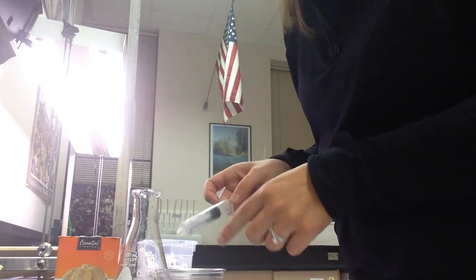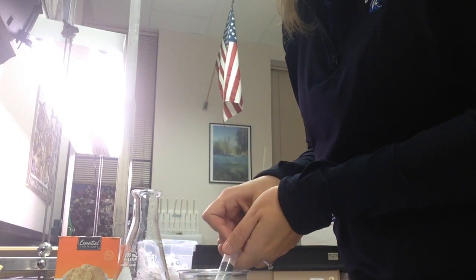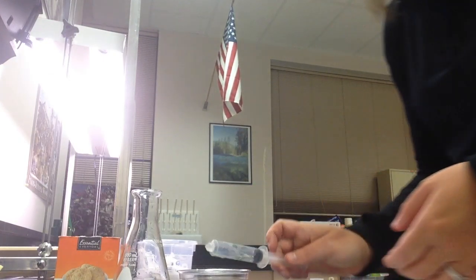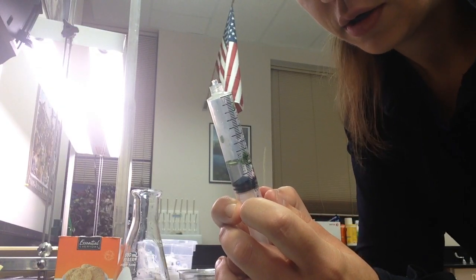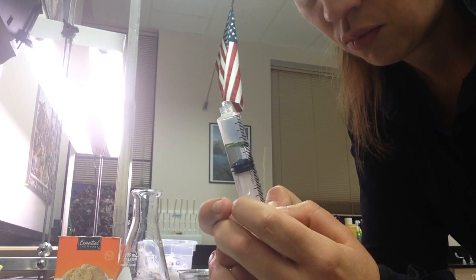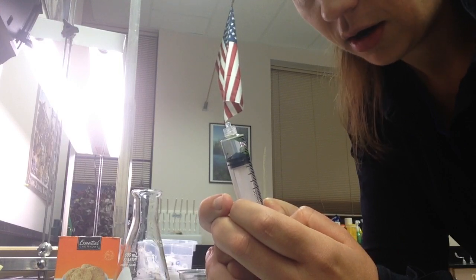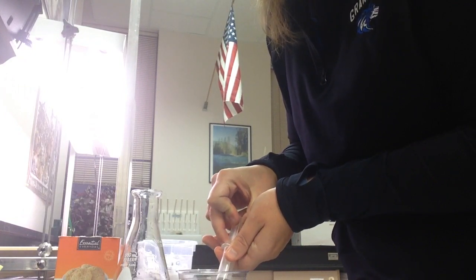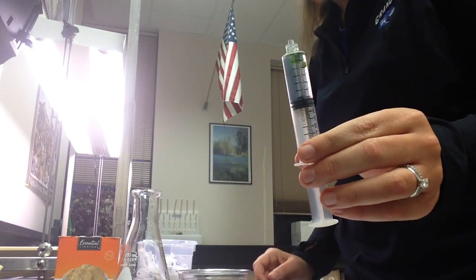I'm going to take some of my CO2 water and suck it up into my syringe. This takes a little bit of practice. I've pulled up as much of my CO2 water as I can, then I'm going to get the air out. You want to have about half full.